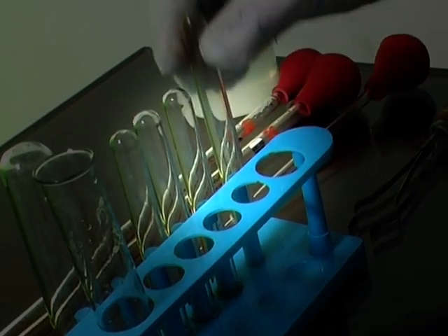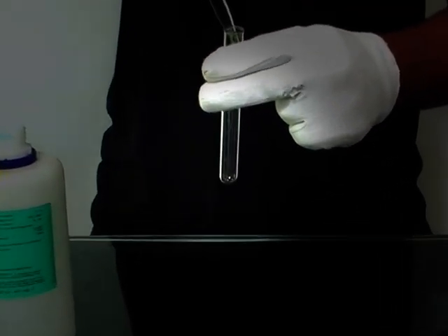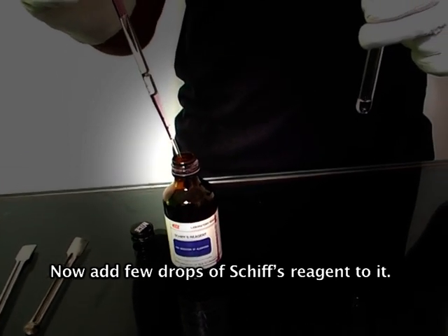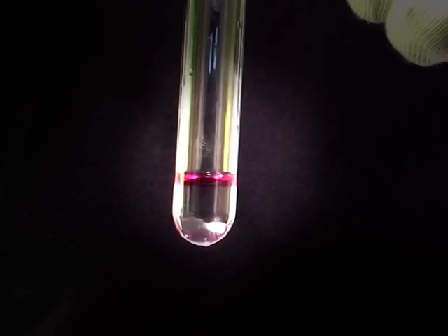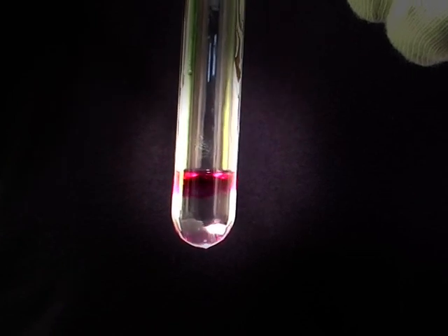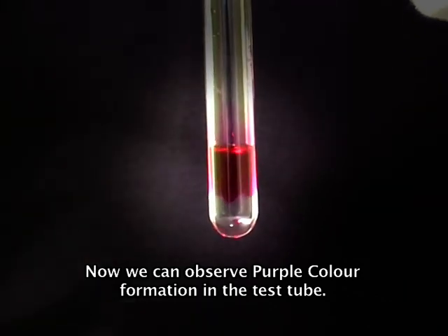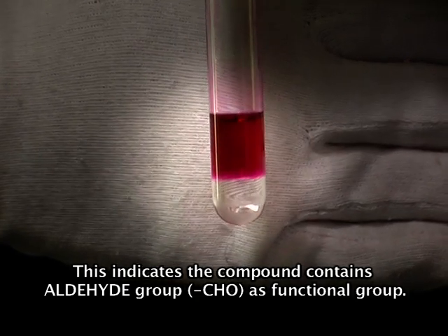Now take a clean test tube. With the help of a pipette, add 1 ml of sample. Now add few drops of Schiff's reagent to it. Now we can observe purple color formation in the test tube. This indicates the compound contains an aldehyde group as a functional group.